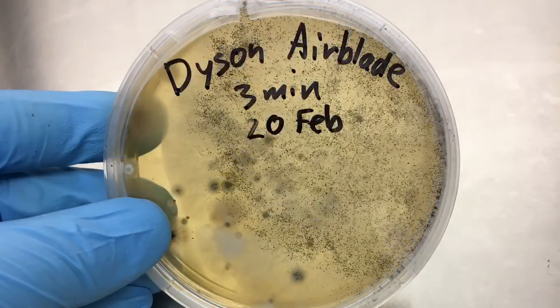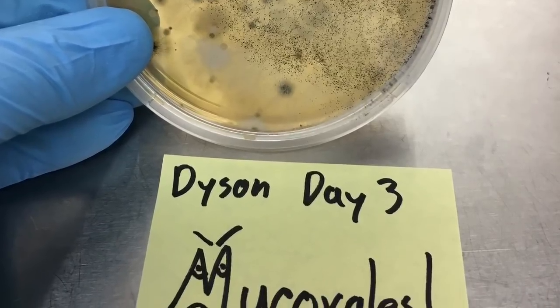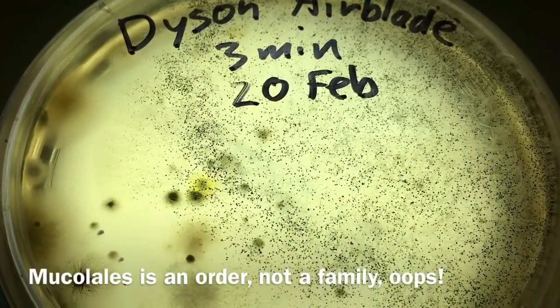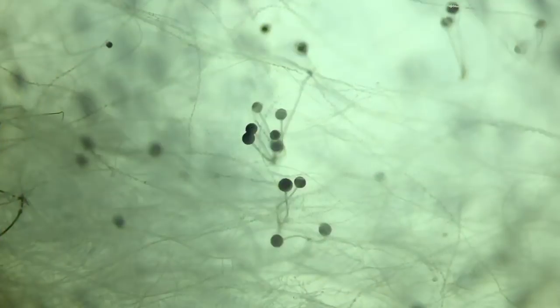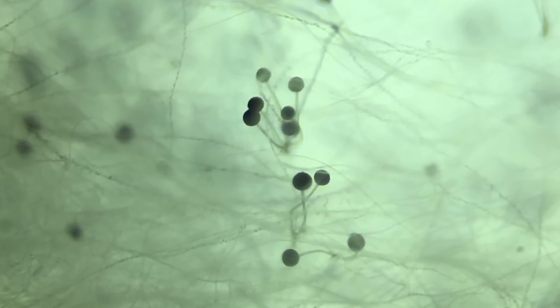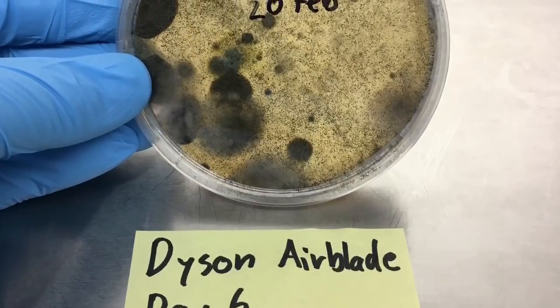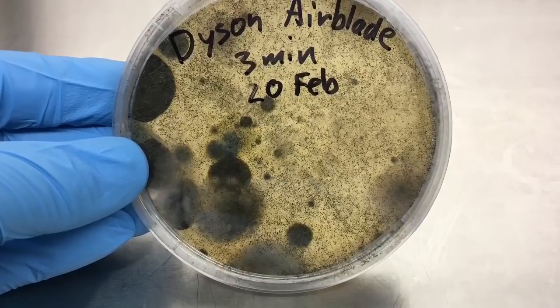Unfortunately, that diversity worked to our disadvantage, as by day three the plate was half taken over by a very aggressive fungus in the family Mucorales. This family includes the genera Mucor and Rhizopus, which many of you may recognize as the classic bread mold that's often illustrated in high school textbooks. When Rhizopus takes over a plate, it makes it almost impossible to get pure subcultures out of the mix.